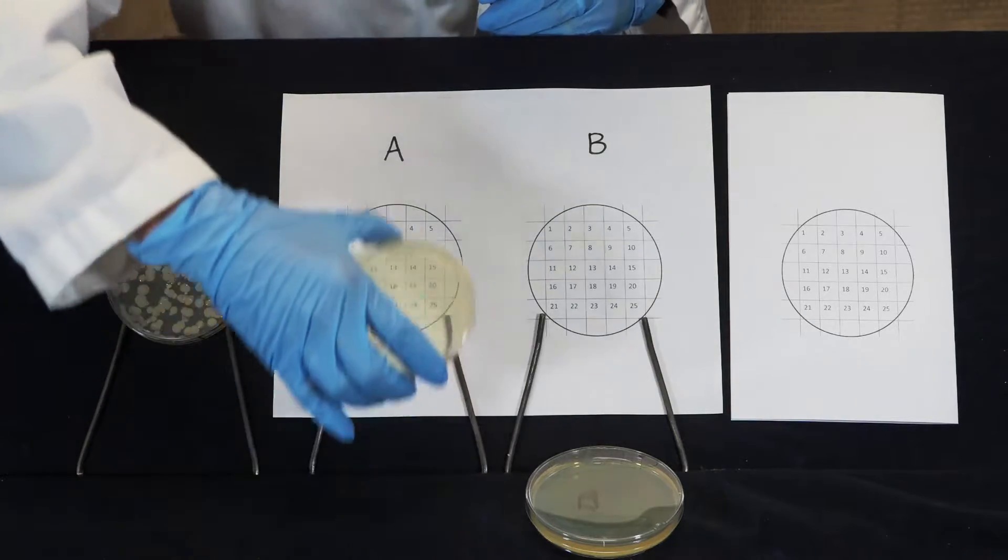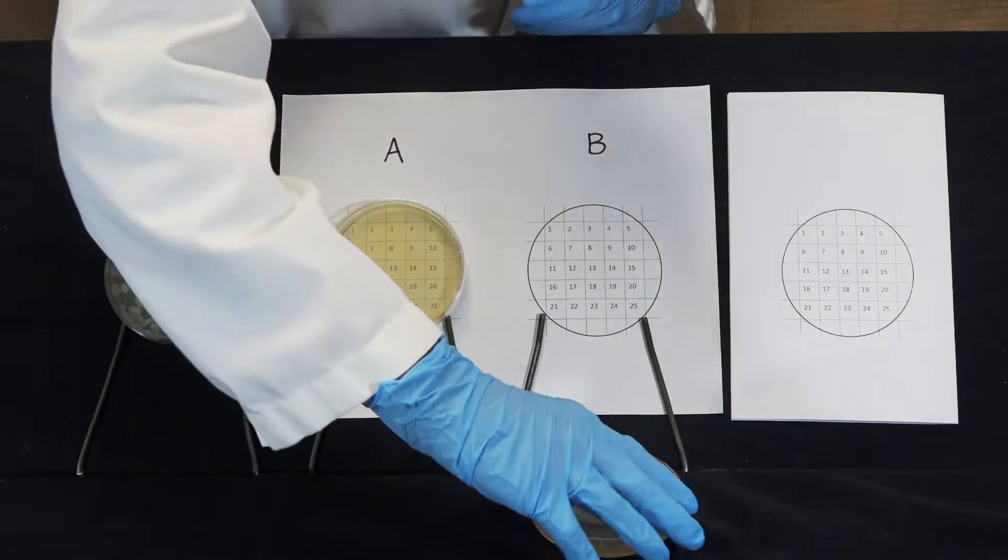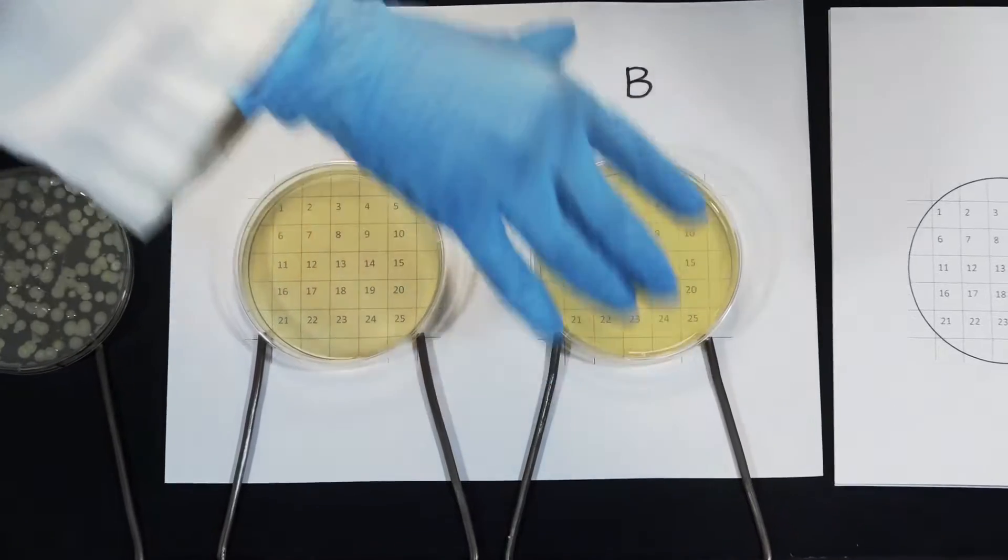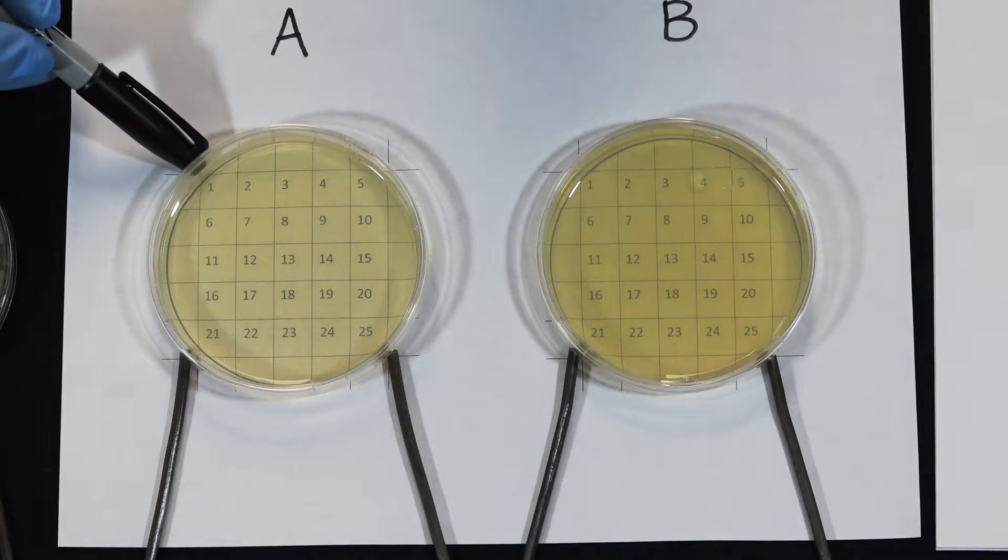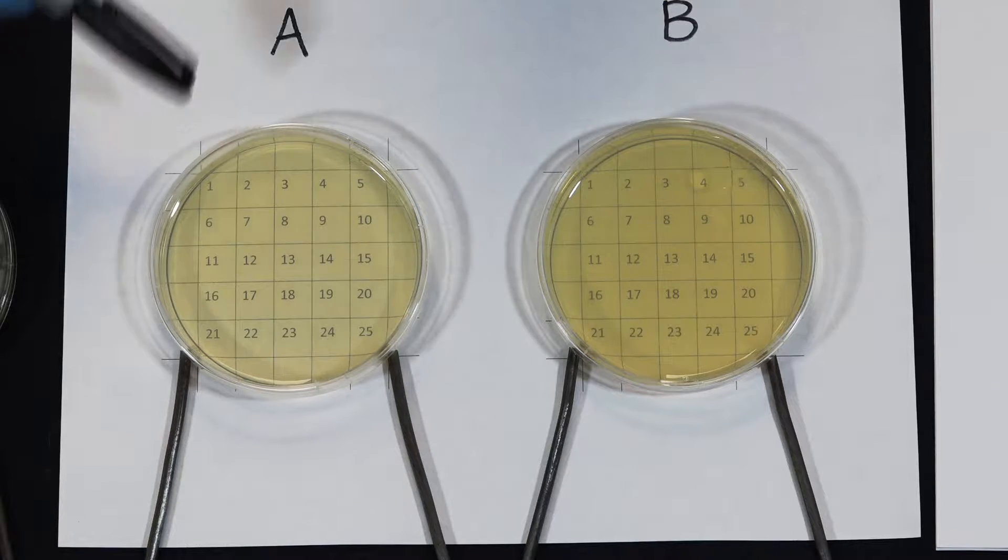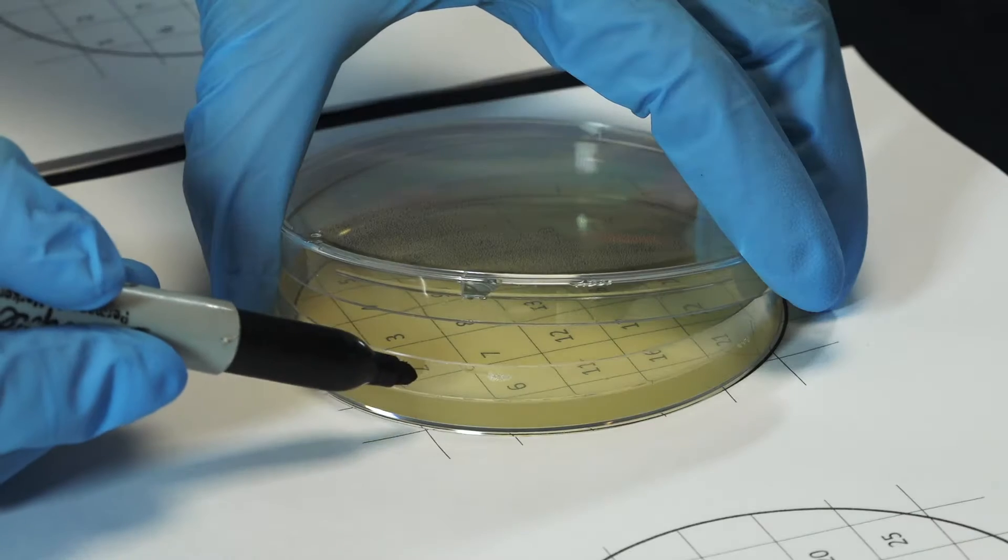We'll start by aligning our Petri plates over the grid. Then we're going to mark a reference point by square one on both the grid and the plate for both plates.